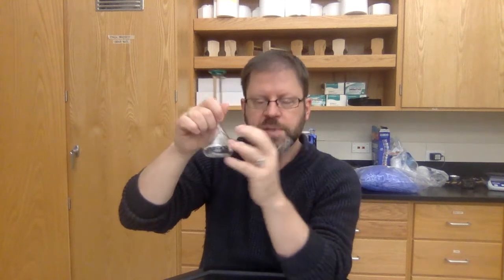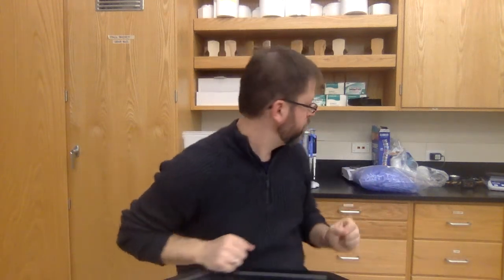So some grams per milliliter, whatever units you want to be in. Then you can quantitatively, either using these guys or whatever device you want, load up a sample of vitamin C of a known quantity in the bottom of an Erlenmeyer flask.